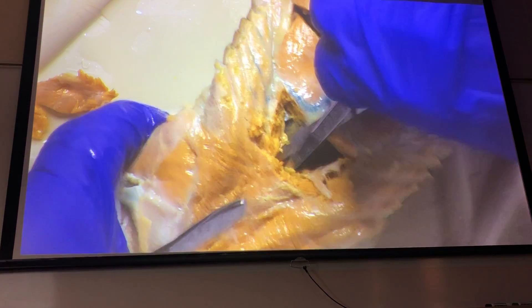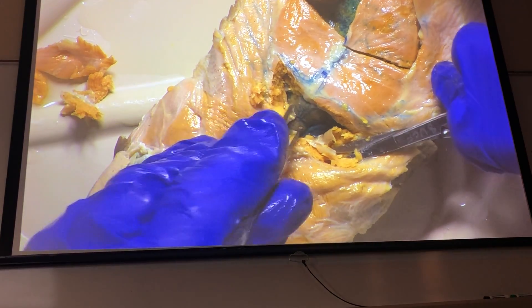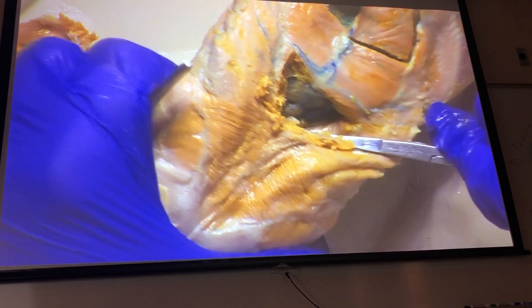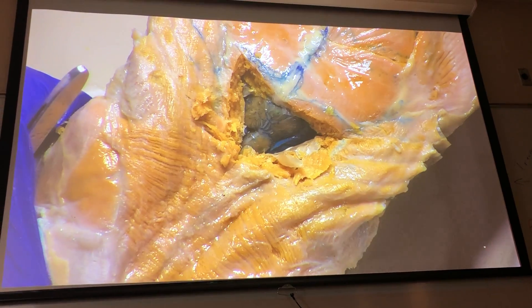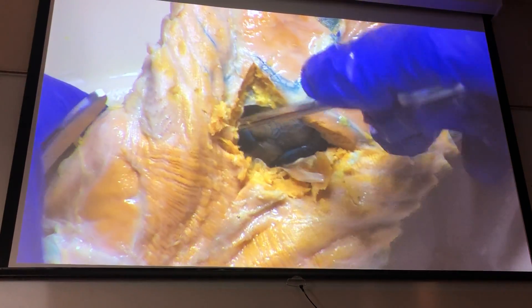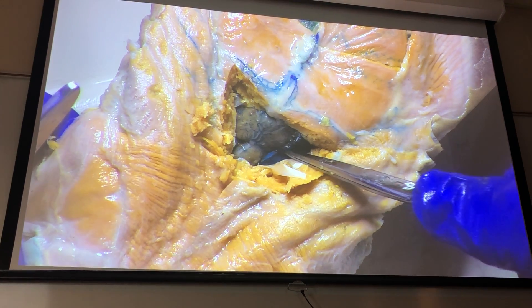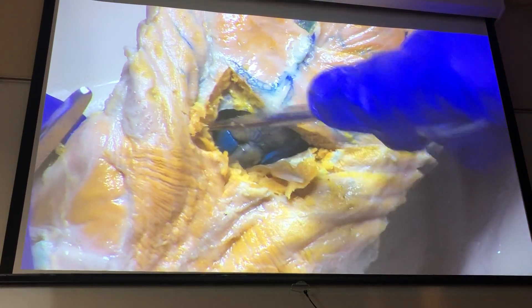I think we can go up just a little bit more cranial here. So here you can see the shark's heart. There's our conus arteriosus — uniform width because we have no bulb on it. There's our ventricle, and on either side of the conus arteriosus is the atrium. It looks like there are two atria like in your mud puppy, but there's only one — it's U-shaped.